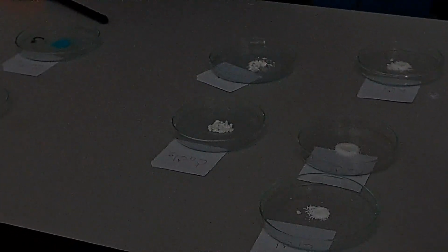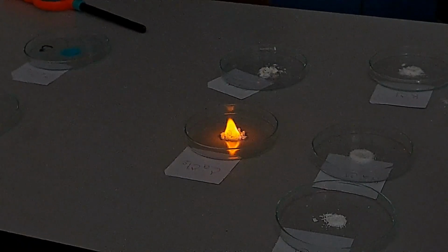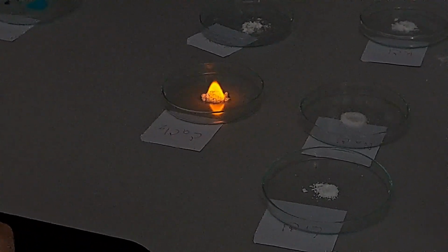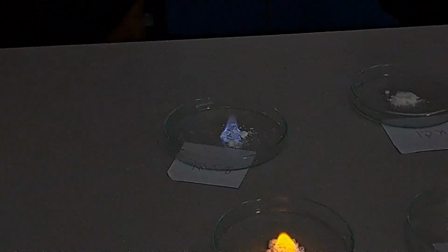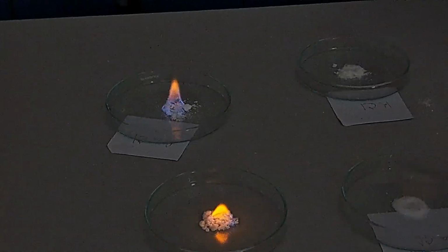It's orange, right? And green. So this is barium chloride. I will light everything up together in the end. It's gonna be cool.